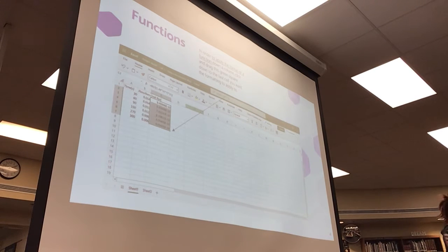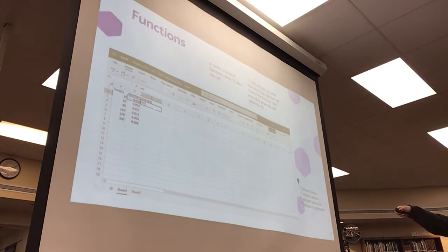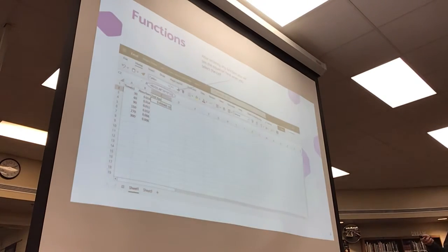Alright, so this is any time you use the data of a cell and not your actual recorded data. Just as I showed you before, using cell B2, if you're using a cell in your formula, then every time you use that cell in your formula and you copy the formatting, it'll drag that formatting down.